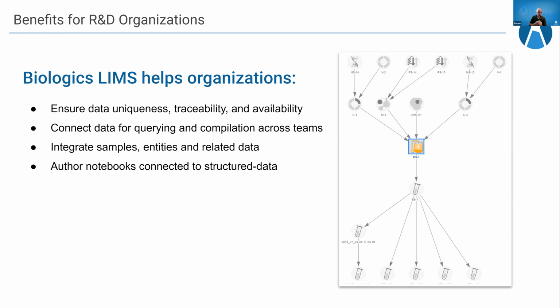Then there's integrating samples, entities, and related data. There are some very practical, everyday benefits of having your data centralized, but also integrated. So managing samples at one or multiple sites is something that can become streamlined, which you saw in Hannah's sample manager presentation yesterday. Your regular data stand-ups or compiled PowerPoint presentations for the purpose of handing data off between teams, between scientists, between sites, require no or much less preparation, because you can simply point to it in the system.